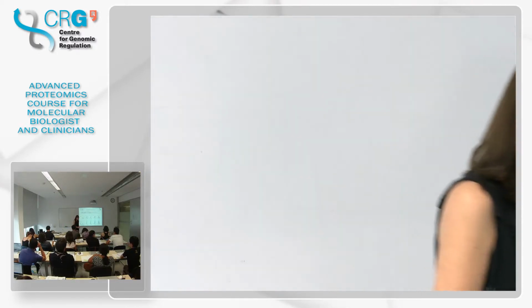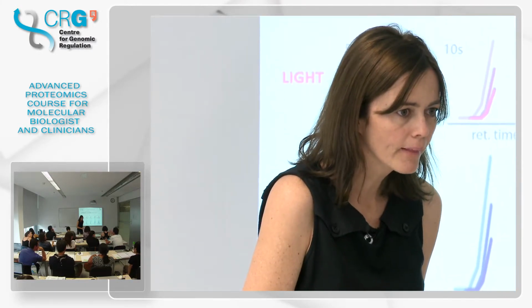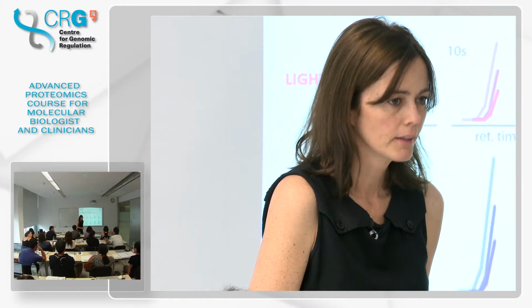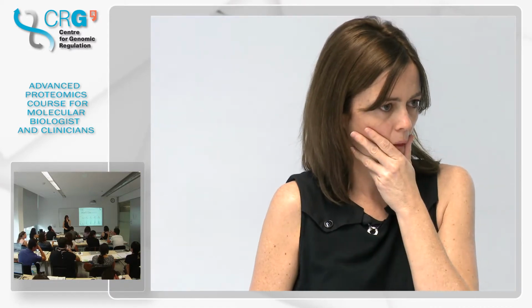When you have to synthesize the heavy standard, you need to make sure that the candidate peptide is unique. How do you choose the unique one? In silico, looking at the whole protein database? Definitely. You have to make sure that your peptide is unique, and you do that in silico. You look in your database. If you're working with human, you can ask if there is any other human protein that has this little sequence. And you need to make sure that it breaks down with that.